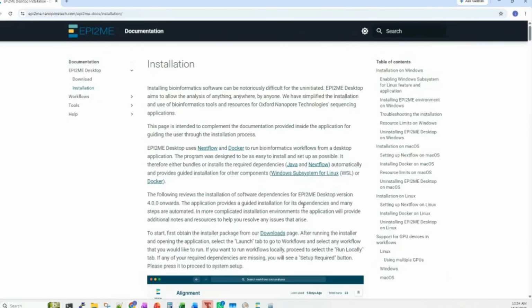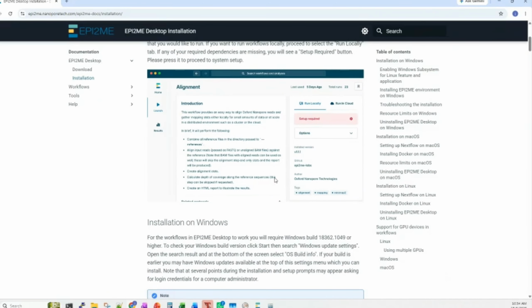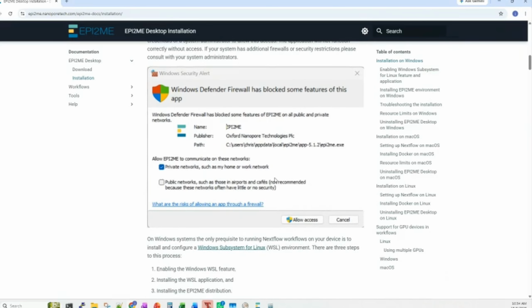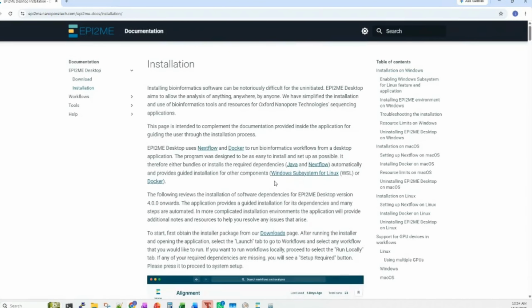As for installation, at the bottom here you can see there's an installation guide. How to set up the program is supposedly a very straightforward process, but to make sure everyone is able to install it accordingly, the guide is very detailed, showing all the screenshots of what a user could encounter during the process. You just need to follow through the process, and there should be no problem installing the program on Windows, Mac OS or Linux.